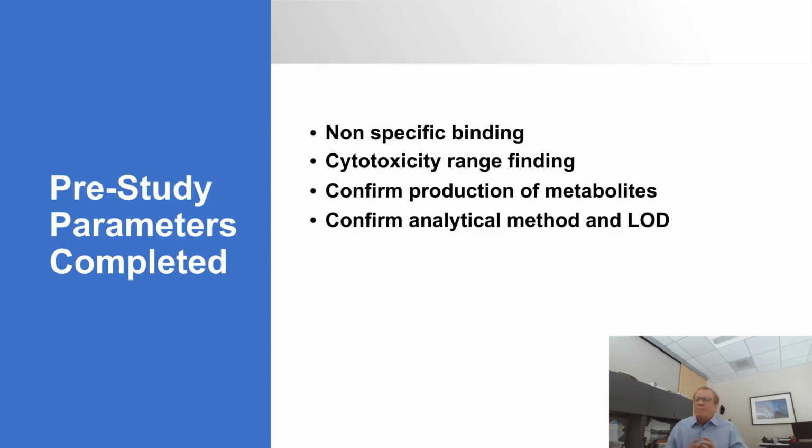So now we've got most of the pre-study work completed. We understand nonspecific binding. We understand what doses we could administer to the tissues without causing detrimental effects. We've confirmed the production of the metabolites that we want to monitor. And we've developed our analytical method.